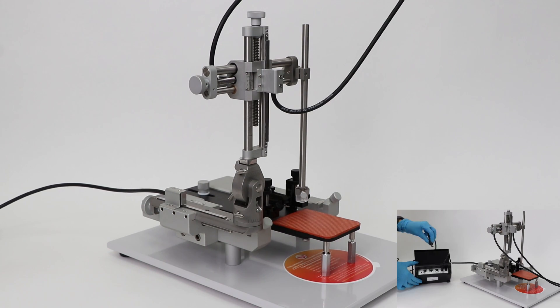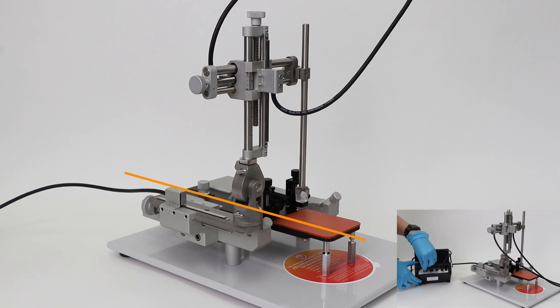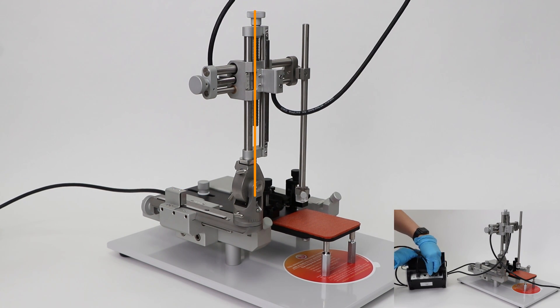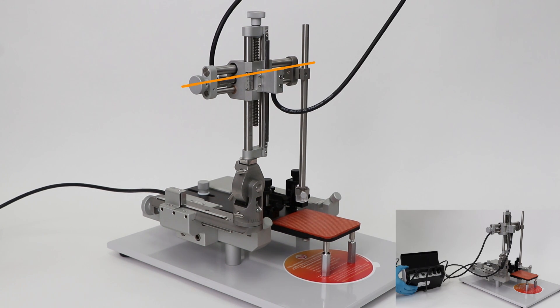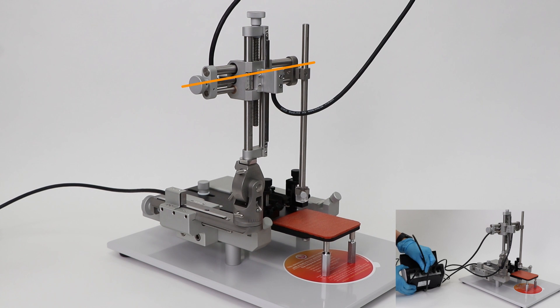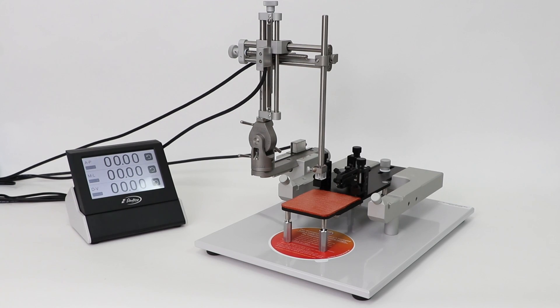Take the cables attached to your anterior posterior, dorsal ventral, and medial lateral axes and plug them into the corresponding cords on the digital display. Your stereotaxic manipulators are now integrated with your digital display.